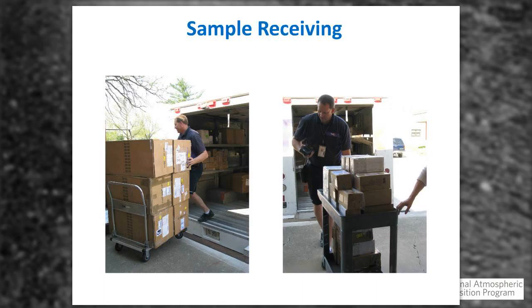And you can tell that this possibly could have occurred today because the temperatures are up enough, but there's leaves on the trees, so I guess that's a dead giveaway. But we get shipments daily from FedEx, United States Postal Service, and UPS. They bring the big boxes as well as the samples. You see the big boxes of the used supplies on the left and the samples on the right. Variation of our AIRMON or AMON network, the AIRMON samples and the NTN samples.